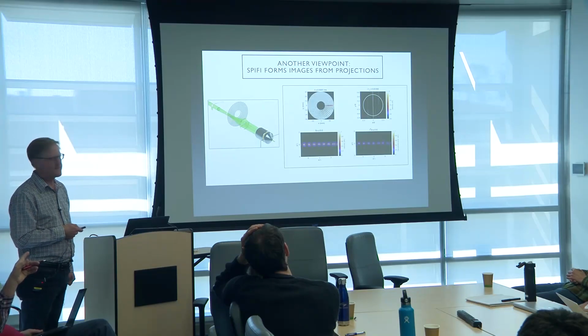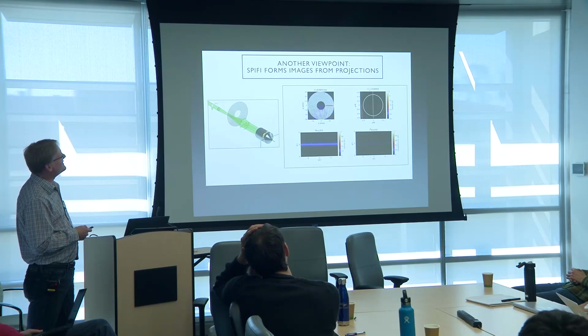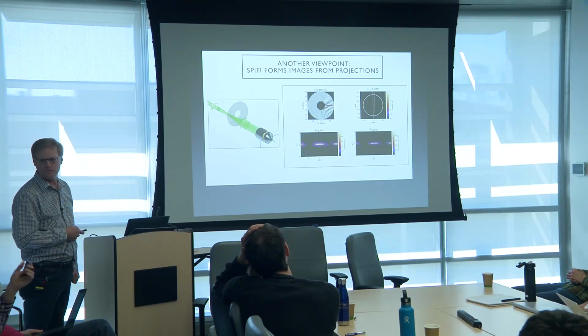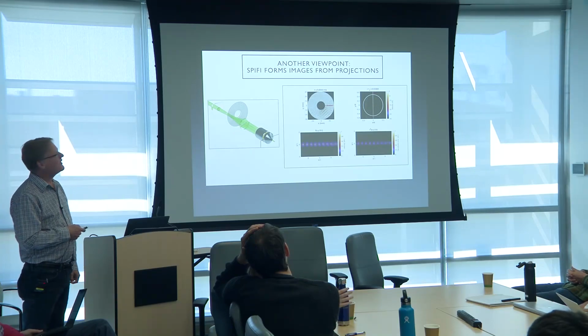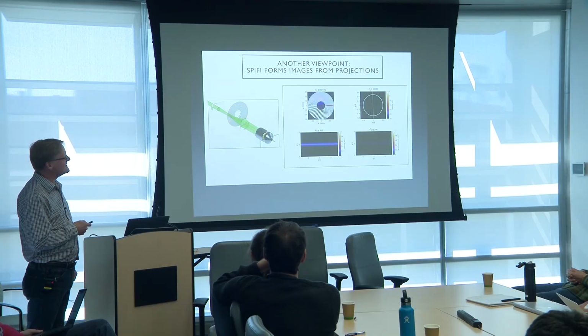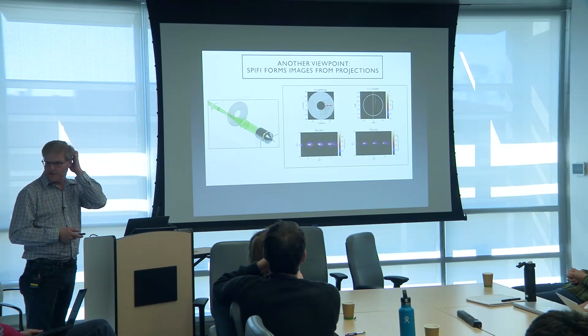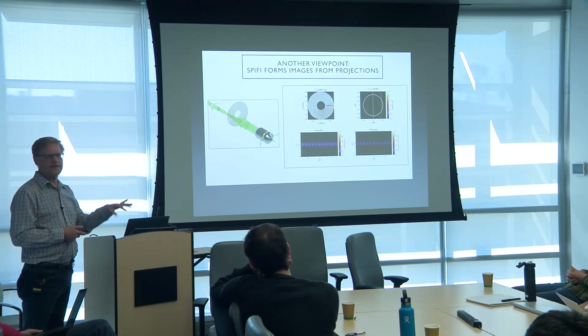Is that the real-time spin of that disk? No, that is just showing, yeah. So we can go a lot faster. What kind of rotation rate do you use? Full range. So right now in this system, we'll spin it up to around 400 hertz. And then we'll show you how to go much faster towards the end of the talk.